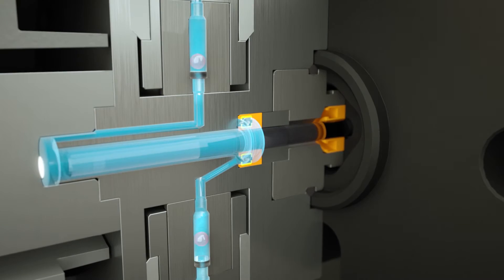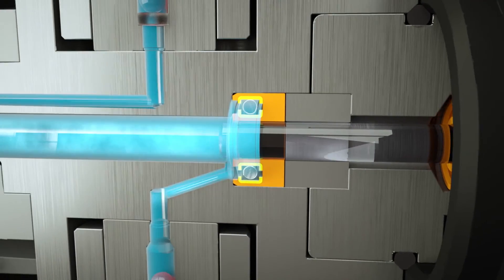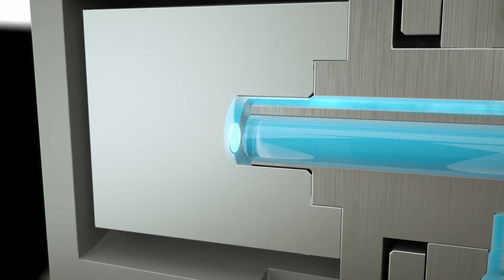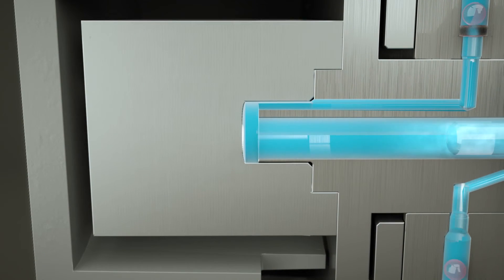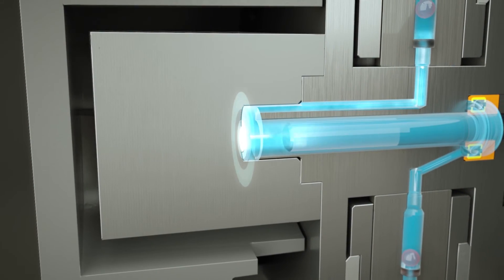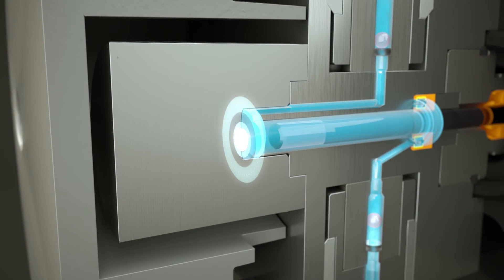The pump chamber inlet channel is located close to the seal and directed at the seal for thorough flushing of the back end of the chamber. The plunger reaches to the very end of the pump chamber and, because the outlet is also located at the end of the chamber, no room remains for air to stay behind. The pressure sensor membrane is seamlessly integrated in the pump chamber wall — there's no channel connecting the chamber and the sensor. No channel means no place for air to hide.